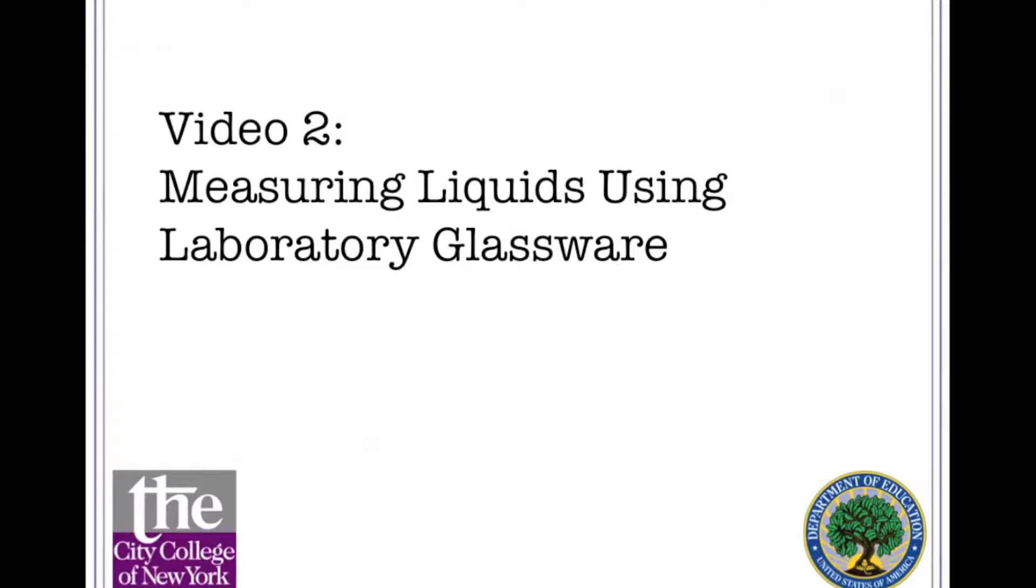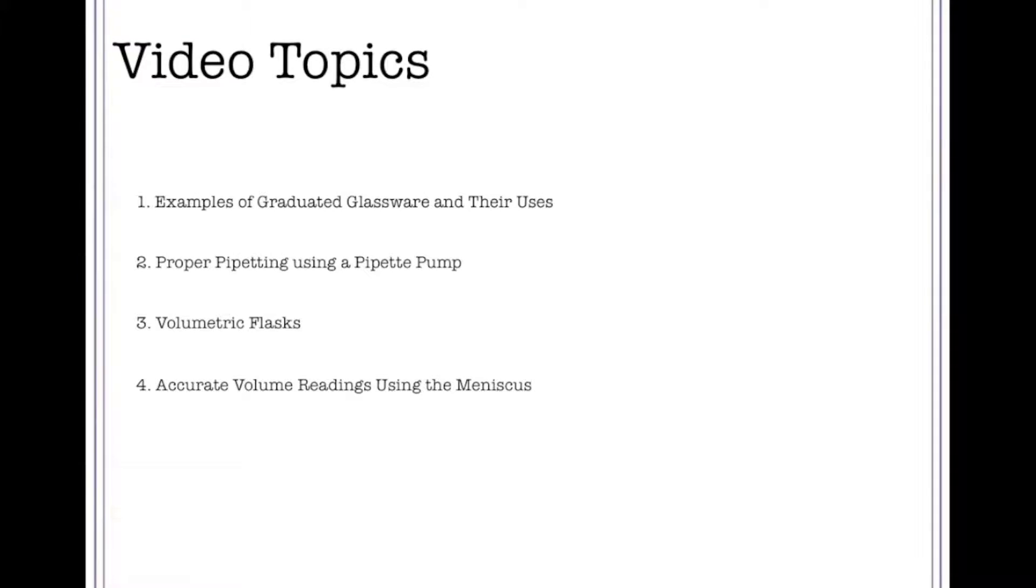Video 2: Measuring liquids using laboratory glassware. Video topics include examples of graduated glassware and their uses, proper pipetting using a pipette pump, volumetric flasks, and accurate volume readings using the meniscus.